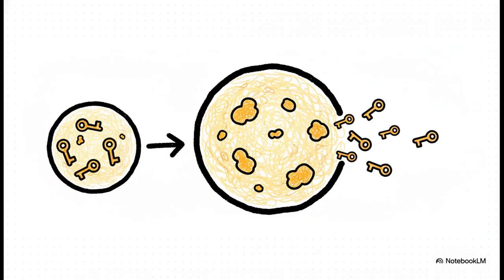Now, here's something that's really crucial to understand. Staph aureus actually makes two different forms of this enzyme. First, you've got bound coagulase, which is often called clumping factor, and it's literally anchored to the bacterial cell wall. Then you have free coagulase, which is an enzyme the bacterium just squirts out into its environment. And because there are two forms, guess what? We have two different ways to test for them.